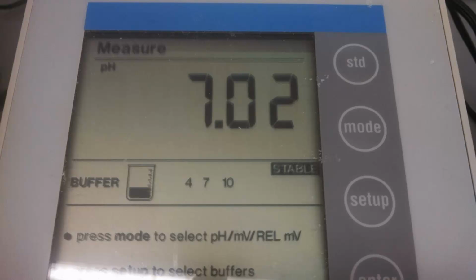As you're collecting data with your pH electrode, you're going to dispense 2 milliliters of titrant, read the pH. Dispense 2 more, read the pH. At each of these points, you need to write down the pH value in your notebook. So you should have a very large table of data in your notebook. The way that you know when you're ready to write down the number on the screen is when you see the word stable, like you see here.